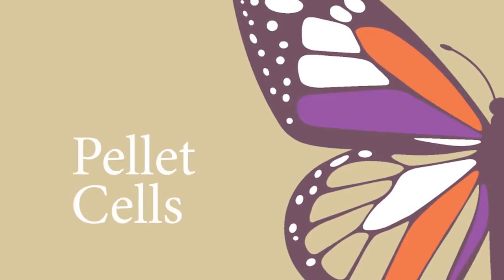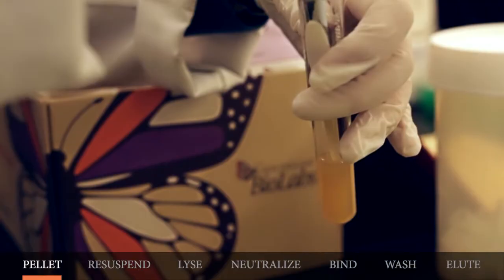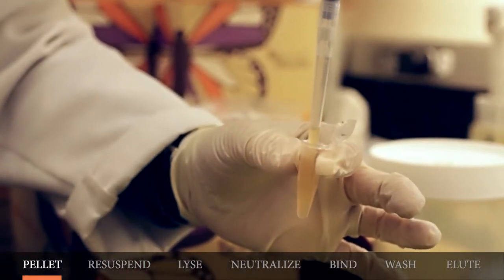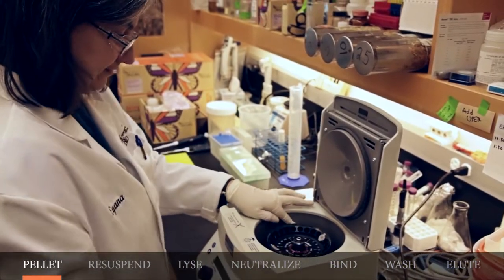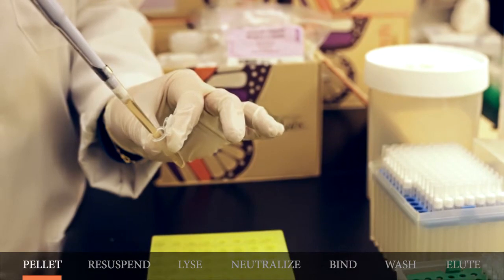Now to the first step, the pelleting. You will need to pellet between one and five mils of bacterial cell culture by centrifuging at 16,000 G or about 13,000 RPMs for 30 seconds. After that, make sure that you carefully discard the supernatant.